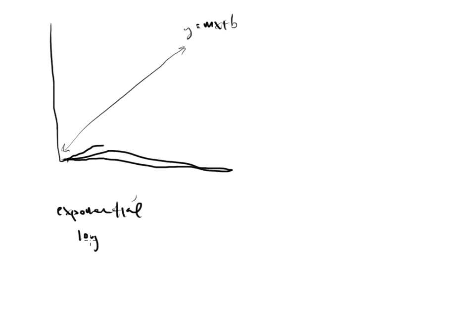When they do, we try to modify the x or the y axis to make it linear, and we try to get out of that arena whenever possible. Sometimes, though, there's no option. We just make the deciding factor that this is the way we're going to do a calibration curve. It's going to be non-linear and fit an exponential curve instead, which is fine. As long as people know the equation, you will be able to solve it just like you do for linear curves. No big deal.